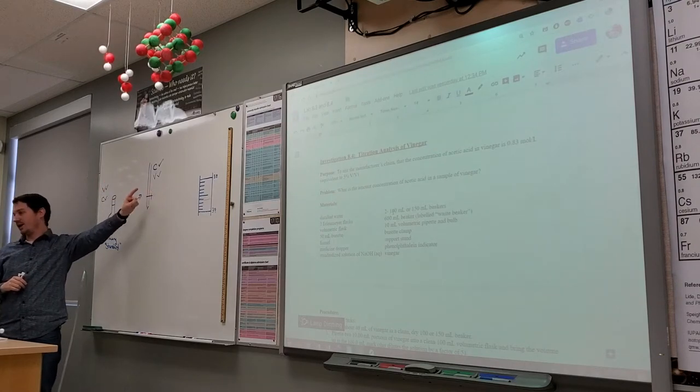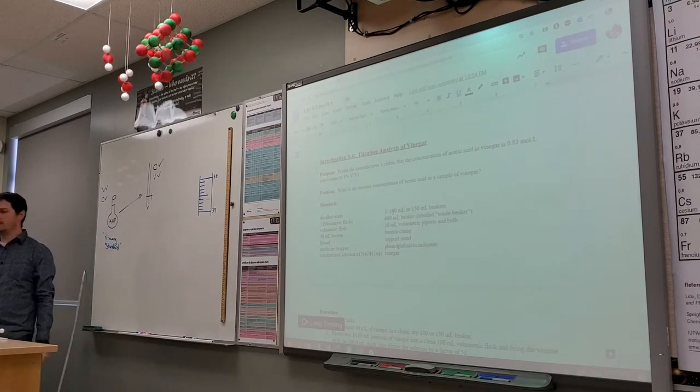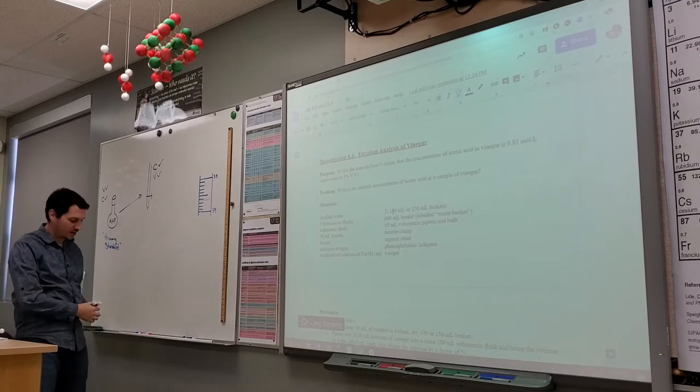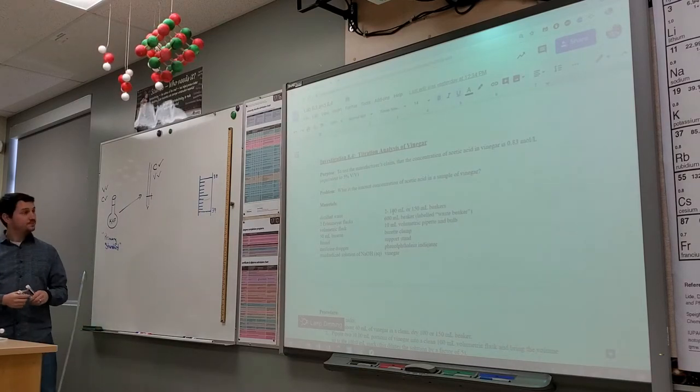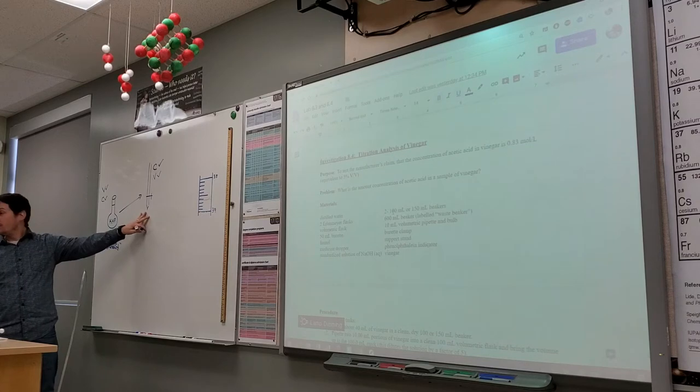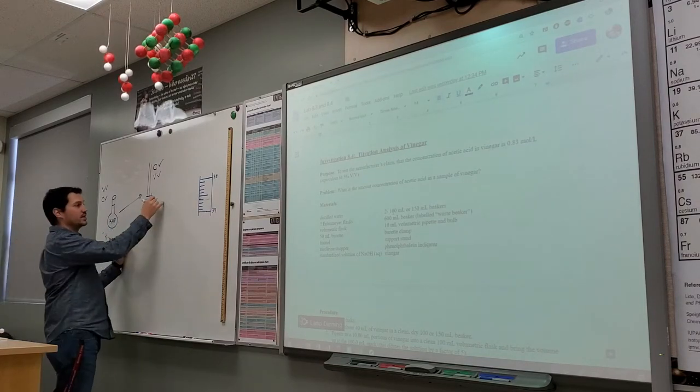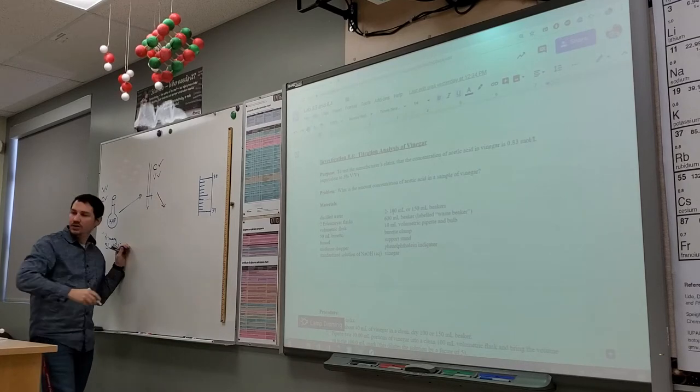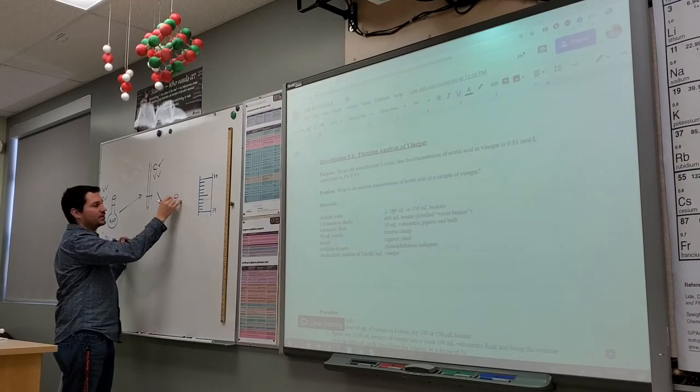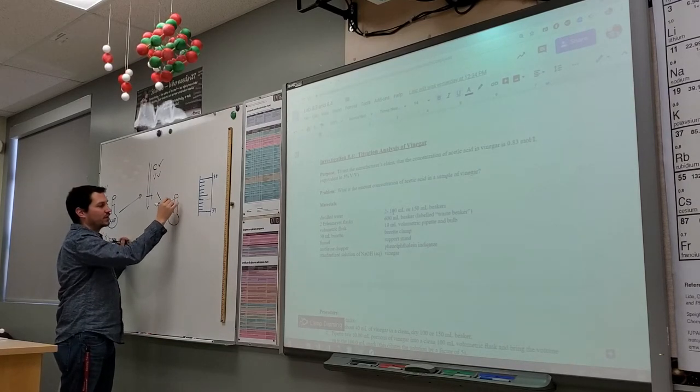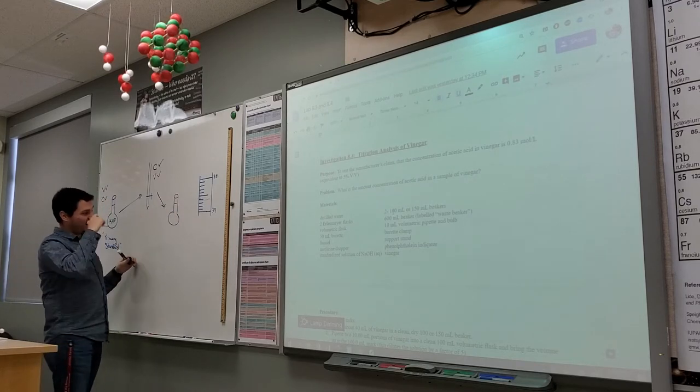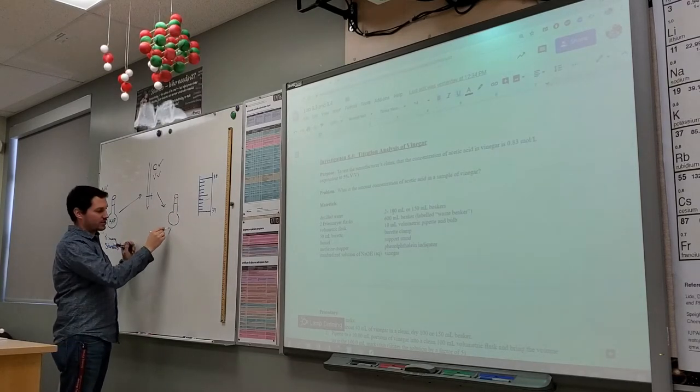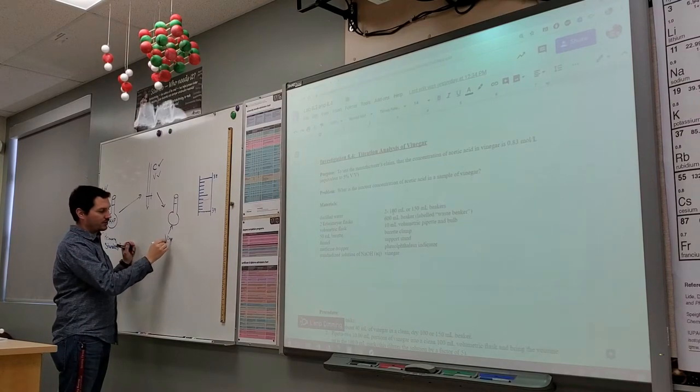It's okay if you haven't done the math yet, but you do have to do this math first. Now we're going to take our sodium hydroxide - we know what our concentration is - so now we can titrate our solution of vinegar.